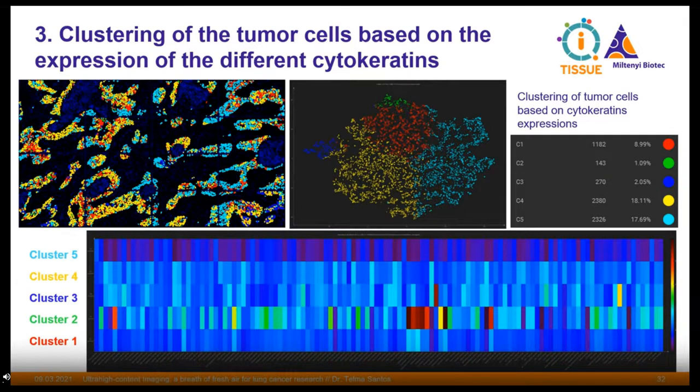And in this case, what I could see is that cytokeratin 14 was high only in this cluster, as well as podoplanin. So this is quite interesting. I do not know. Cytokeratin 14 would be more in epithelial cells. Podoplanin could be also. So this is interesting.